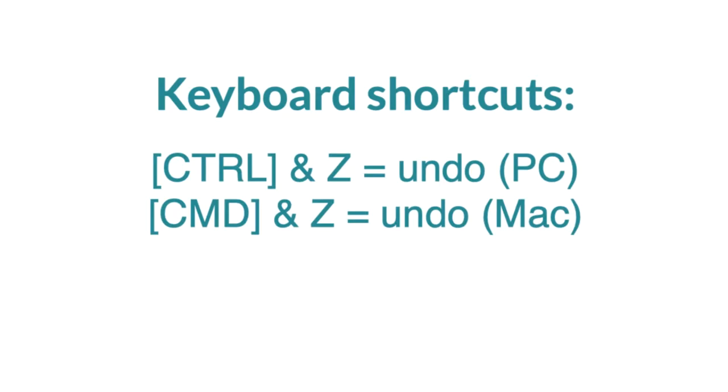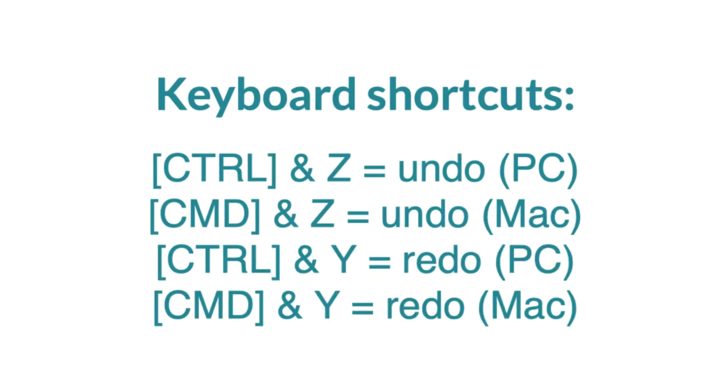The keyboard shortcuts to undo edits is CTRL-Z on a PC or CMD-Z on a Mac, whilst CTRL-Y on a PC or CMD-Y on a Mac will redo the editing.